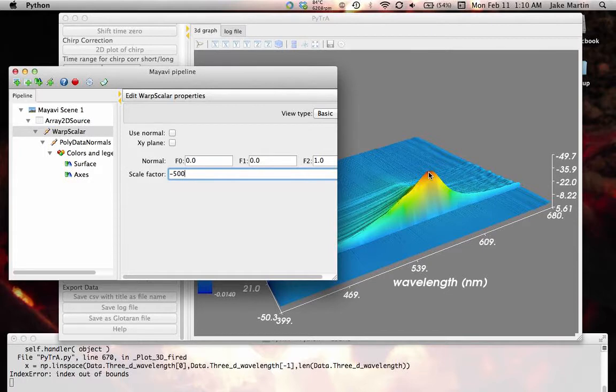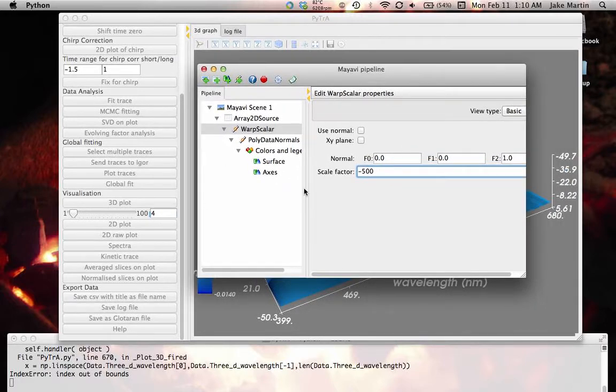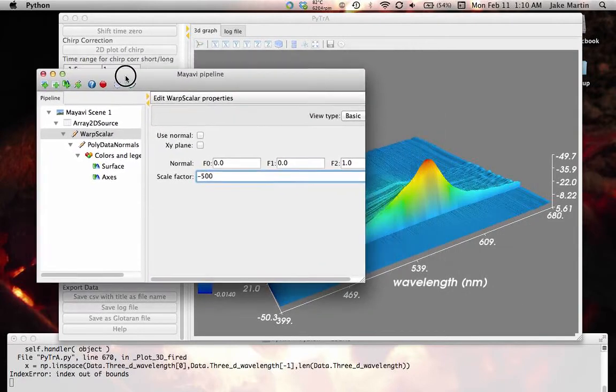Once it has changed that, there's the new position. So I've just implemented that in this little slider here. So this will actually times 4 times 100. So if you type in 5 here, you get negative 500 there.